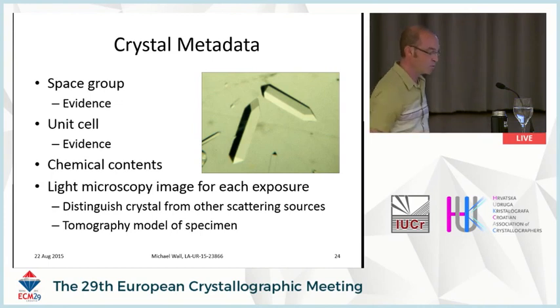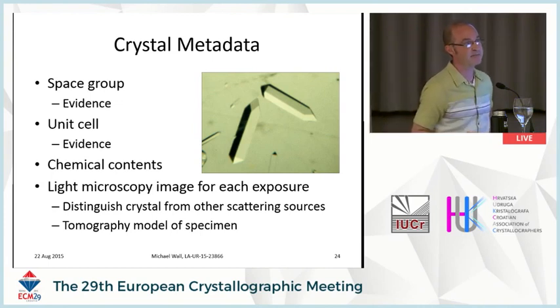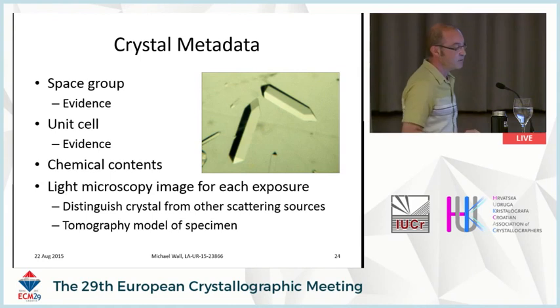And so in looking at Bragg data, mostly we're in the position of being able to distinguish the Bragg reflections from the background just by the small size, their peaked features, and at least to some approximation can be subtracted from the background using some sort of image processing methods. With the diffuse features, we're not really in that position.